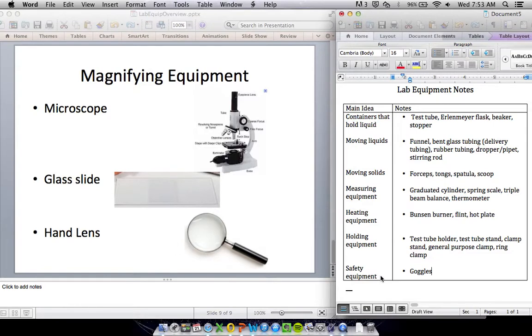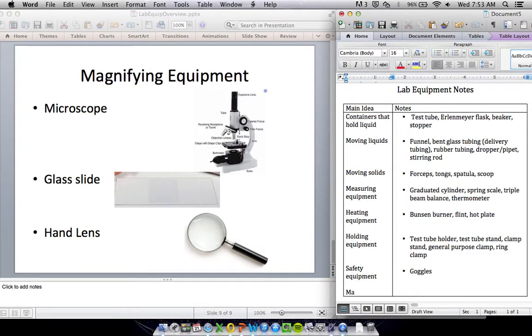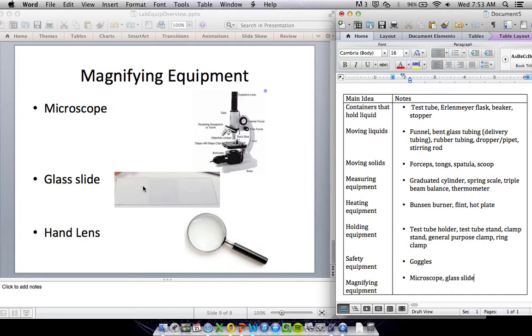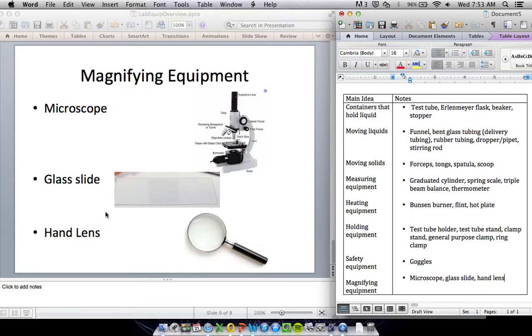And then the last couple things of equipment we're going to look at is magnifying equipment. We've got a couple that we might use this year. We've got a microscope and a glass slide. This is used with the microscope. You put whatever you're going to look at on the slide and look at it under the microscope. And then you have a hand lens. You may call it a magnifying glass, but we call it a hand lens in science because it's a lens and you use it with your hand. A hand lens is just a little bit clearer as to exactly what it is.